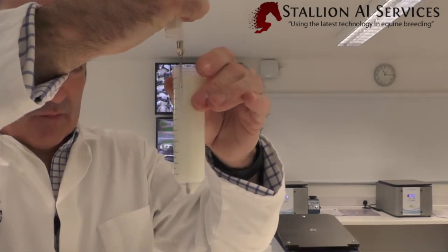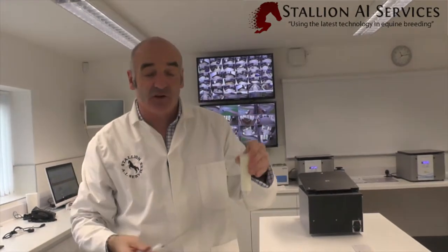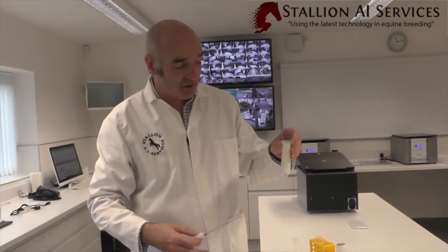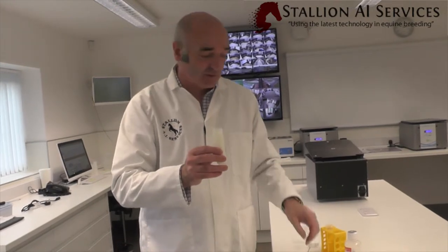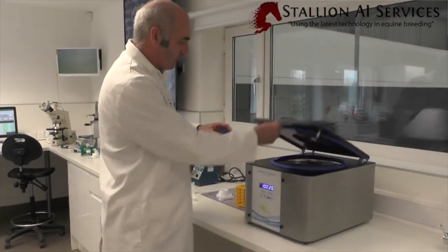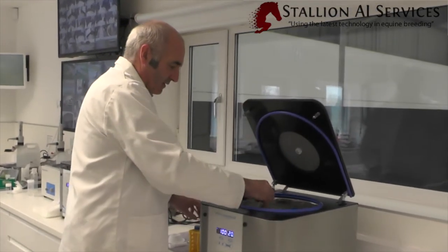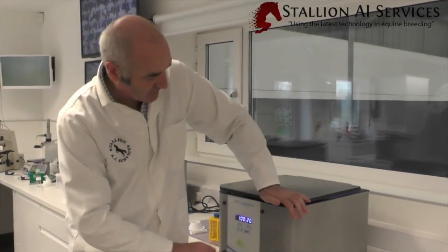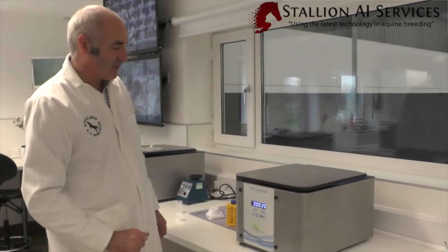When we freeze semen, we always freeze it on top of a cushion, which means we can spin an awful lot faster — anywhere from 1000 up to 1500 G onto this cushion, depending on semen quality, for between 10 and 20 minutes. We're going to balance it up with water on the other side, set it at 1000 G for 20 minutes, and then we'll come back and see how it has spun down.